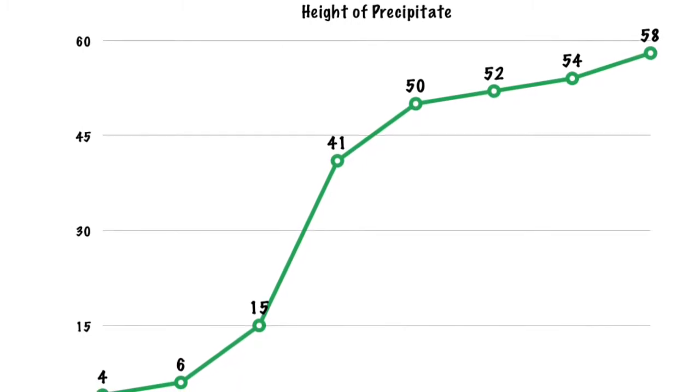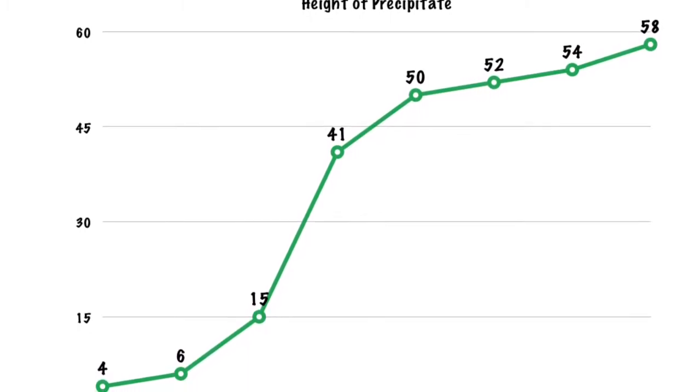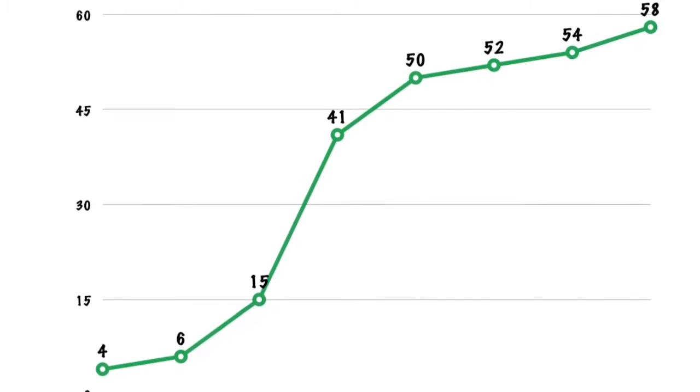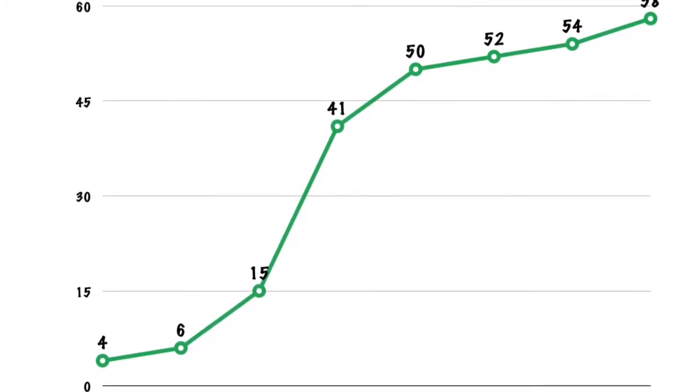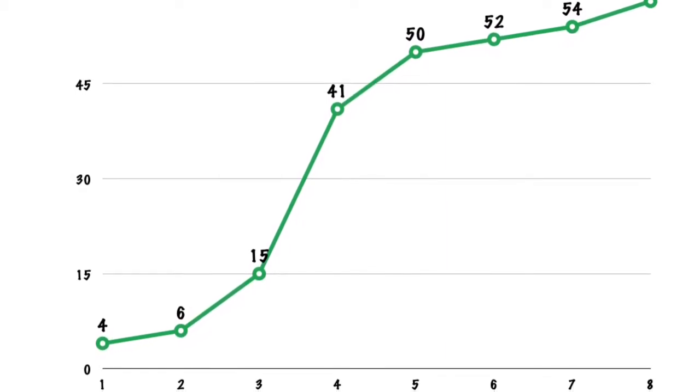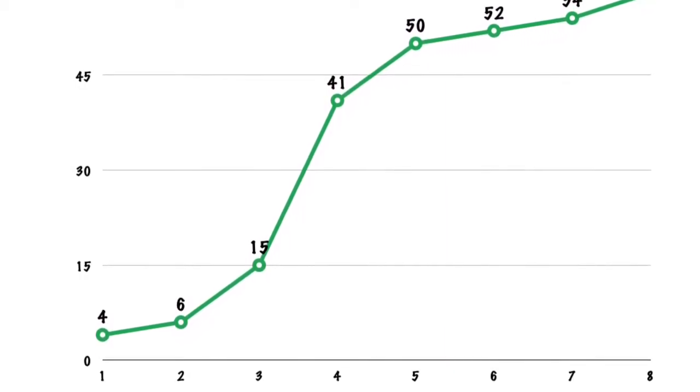From test tubes 5 to 8, CuSO4 is the limiting reactant. It is used completely and the KOH is in excess, so no matter how much KOH is put in each test tube, the precipitate will always be the same.